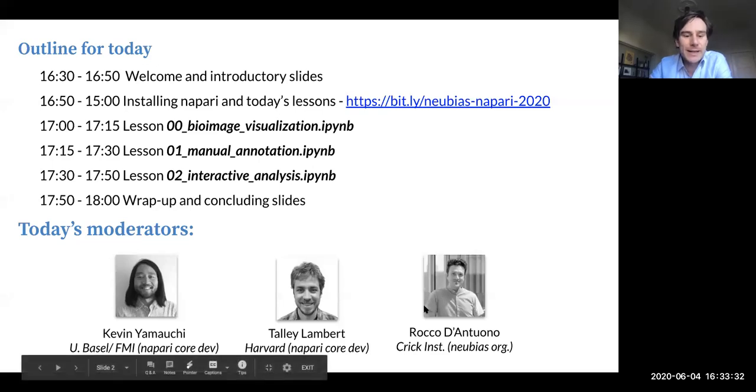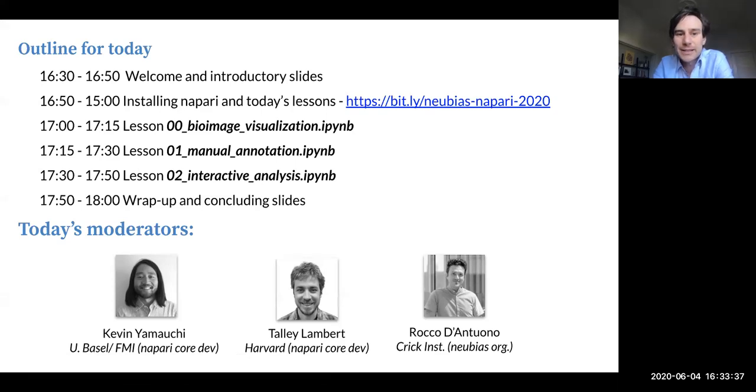So with that, I want to give you a little bit of an outline for today. I'm going to spend about 20 minutes on welcome and introductory slides. Then we'll have about 10 minutes as we transition to installing napari and today's lessons. Then we've got three lessons that are going to be taught out of Jupyter notebooks. The first one on image visualization, the second one on manual annotation, and the third one on interactive analysis. And then we'll have a wrap up and a conclusion.